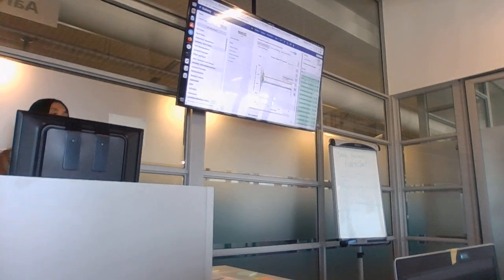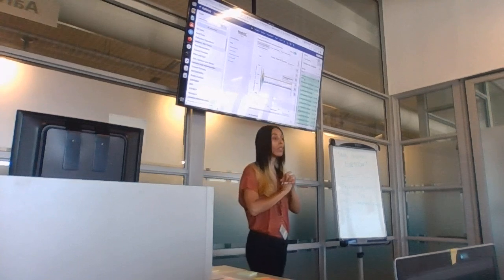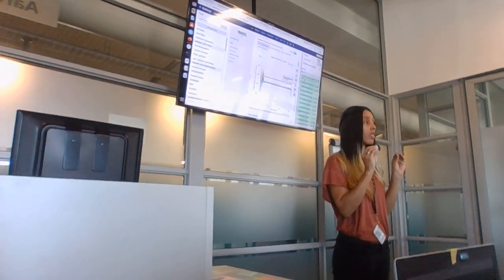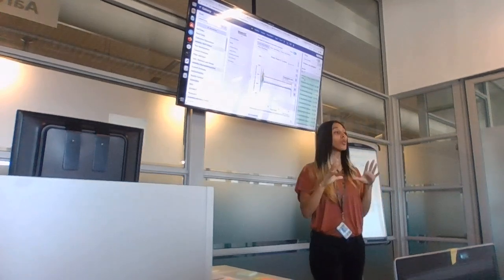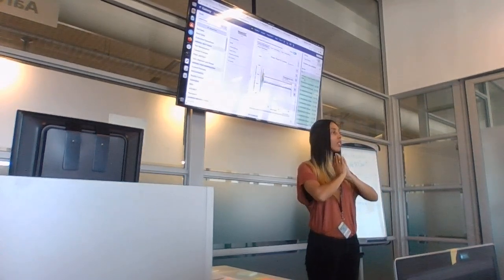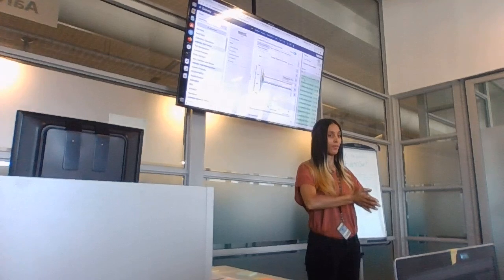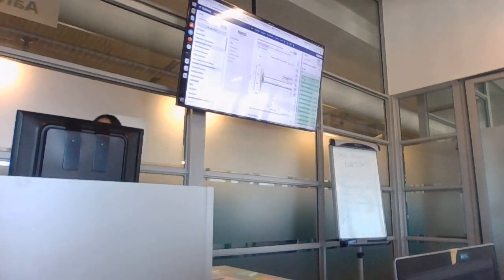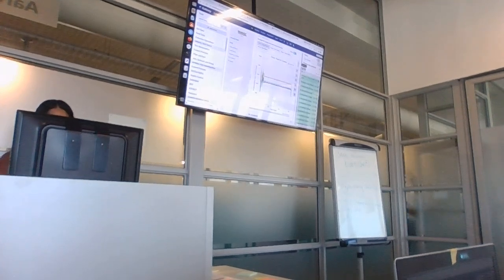Okay, so I ran Kraken. What I did was, and you can build this dataset for the future, but just not run it, create a new history and call that history Kraken or Kraken 2, because I'm going to show you how you can move datasets between histories.